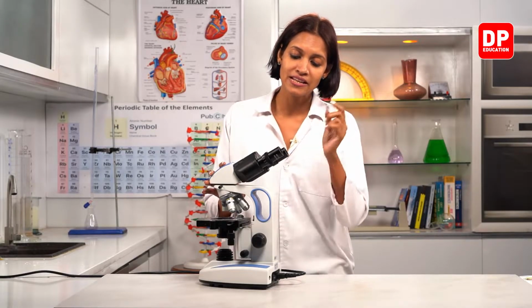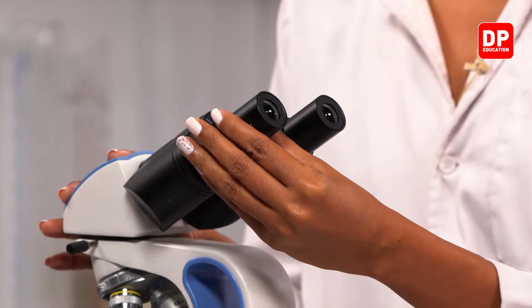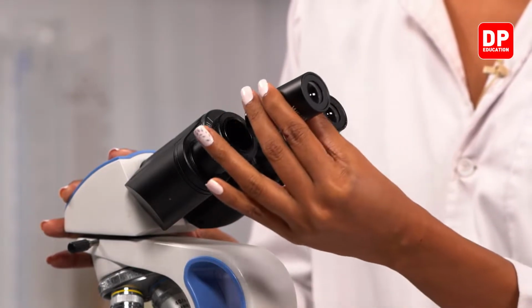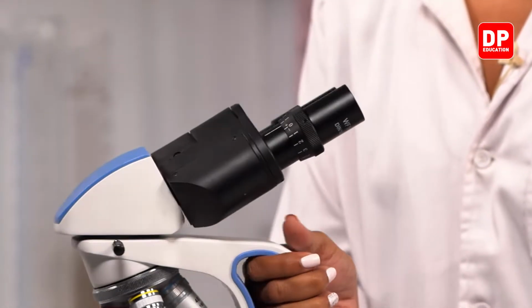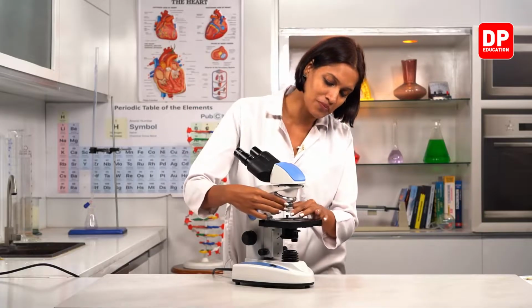Now this is the eyepiece. This is the first lens, the lens that is closer to the eye. We can remove it like this. Okay, this is the eyepiece. Right, children? Where's the second lens, children? The second lens is known as the objective. This is the objective, children.